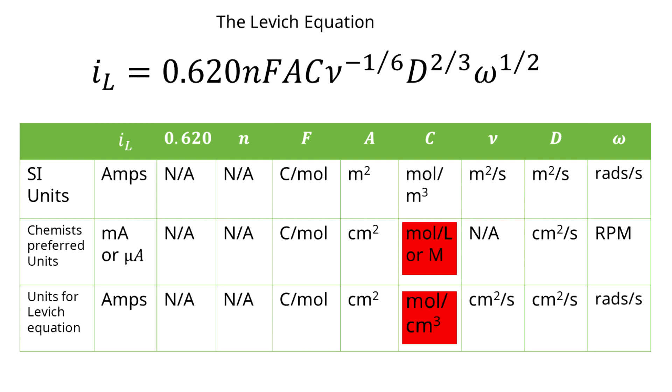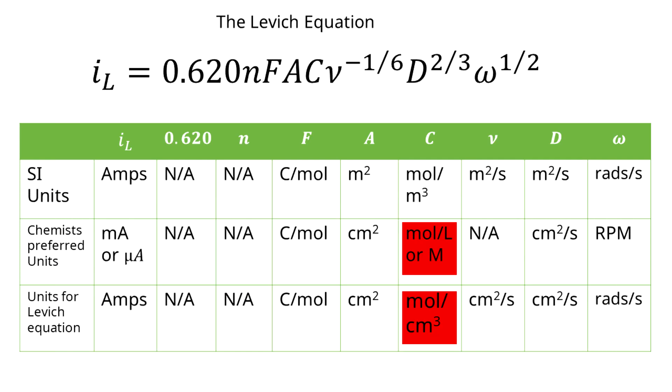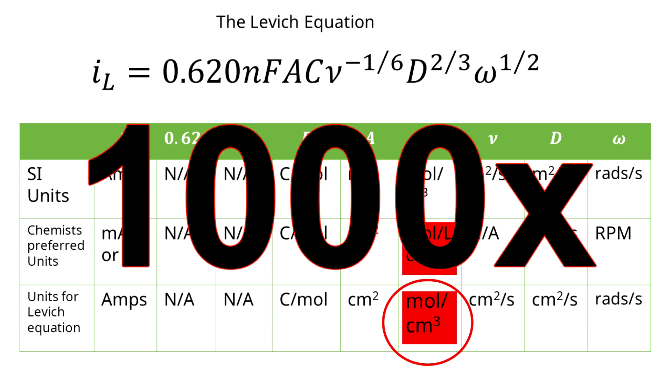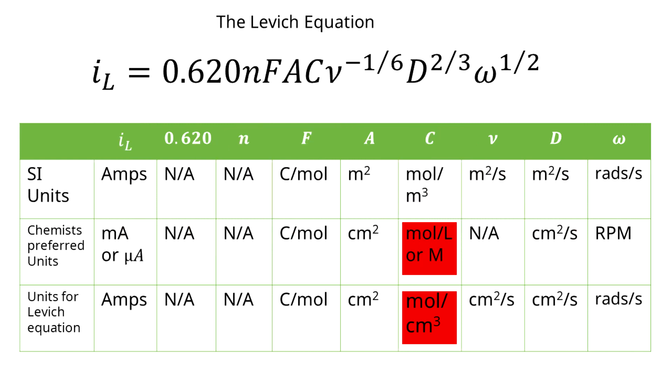Second, and perhaps my most frustrating one is concentration. Chemists tend to think in terms of molarity, which is moles per liter. However, the units of concentration in the Levich equation are moles per cubic centimeter. This represents a factor of 1000 difference, and I've messed up plenty of diffusion coefficient calculations because of it.